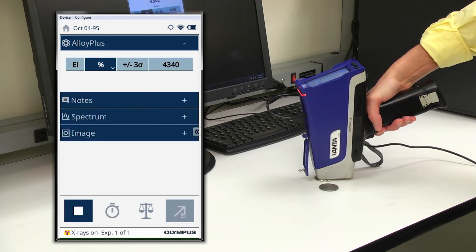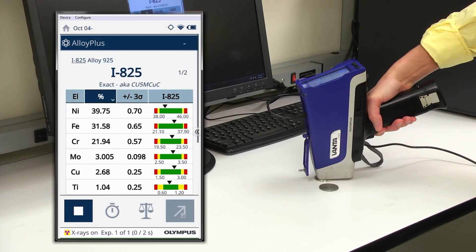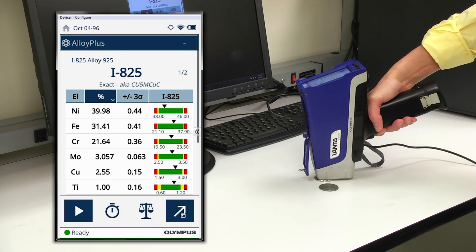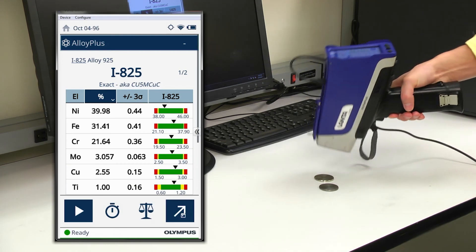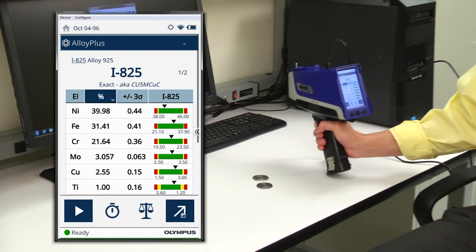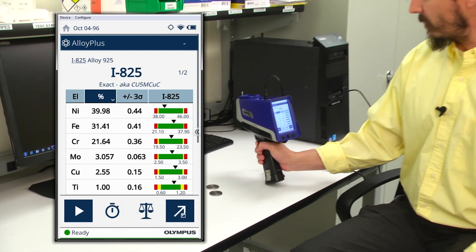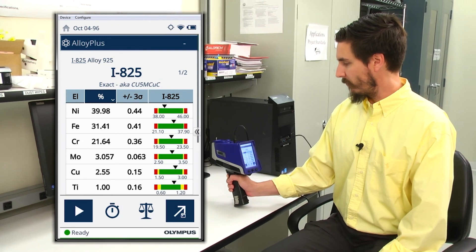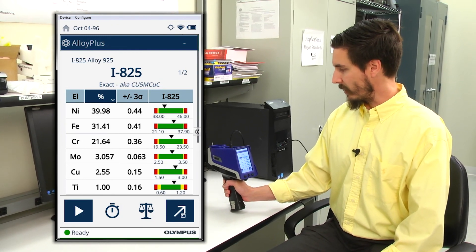Likewise, for another sample, you can see in my two second test, I have an exact match for Inconel 825. So again, smartsort is a very rapid way to do alloy sorting effectively and accurately.